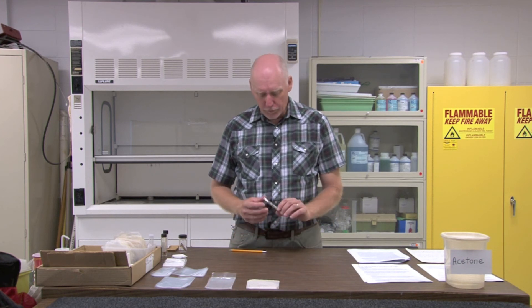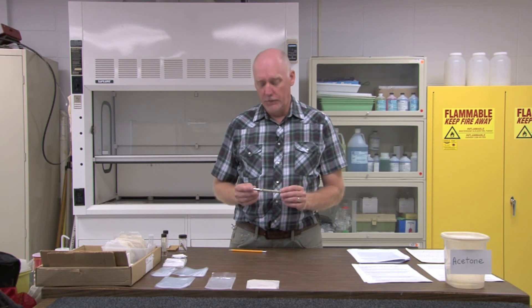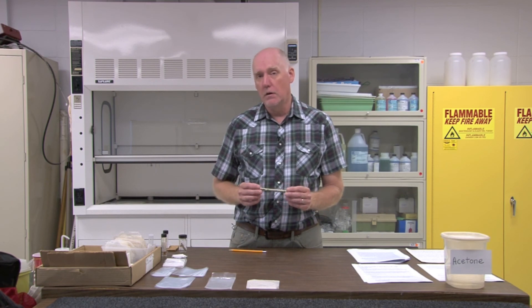For labeling specimens of nymphs and exuvia, use a high quality paper. I use a museum quality paper that's treated with resistol, purchased from Bioequipped Products — a paper that will last a very long time in water or in alcohol. When you write on your label, use either a pencil because it won't run, or a rapidograph pen or India ink pen with alcohol-proof ink. I prefer to use Micron pens that have a pigment ink that is alcohol proof.